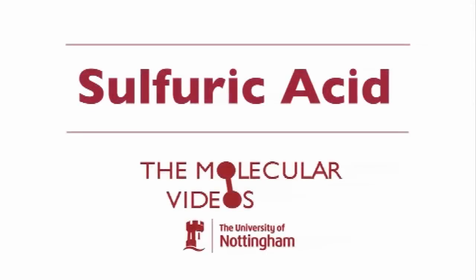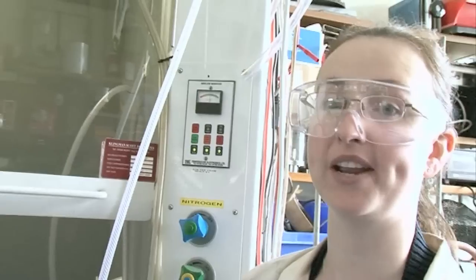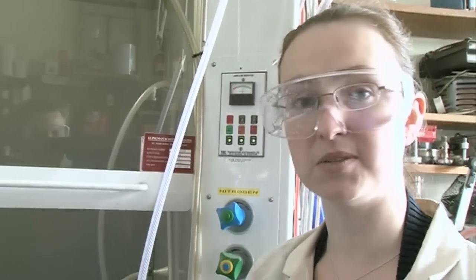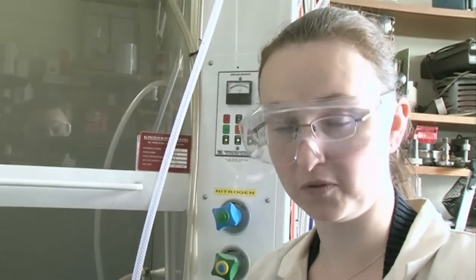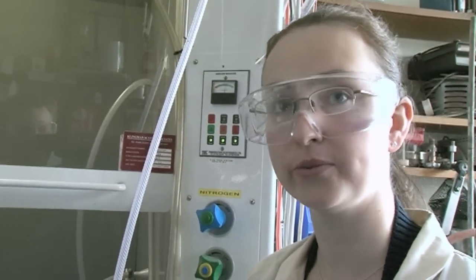Sulfuric acid is one of the most common chemicals in the sense that it is made on the largest scale, millions of tons a year. Okay, so what we're going to do now is a couple of experiments with sulfuric acid. The first one we're going to do is dissolve some sulfuric acid into water, which is an exothermic reaction, so we should see it get hot.